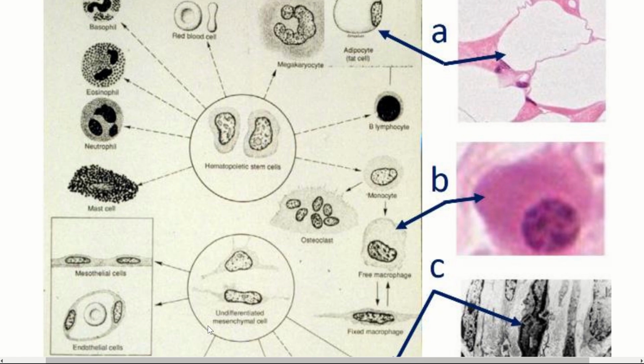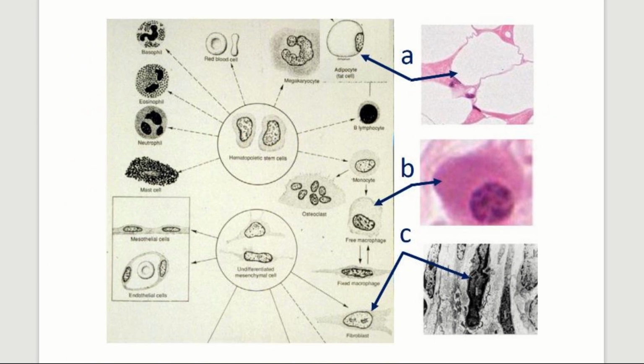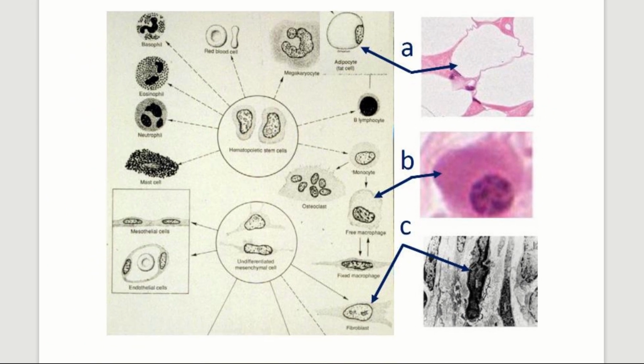Okay, so this one right here, we've got more connective tissue. Now we're just talking about individual cells of the connective tissue. And so what A is pointing to, it even tells you right here, adipocyte or fat cell, right? So adipose tissue, white fat, and then right here, this is that chicken wire we were talking about with those fat cells. So this is also adipose tissue. So both of those are adipose tissue.